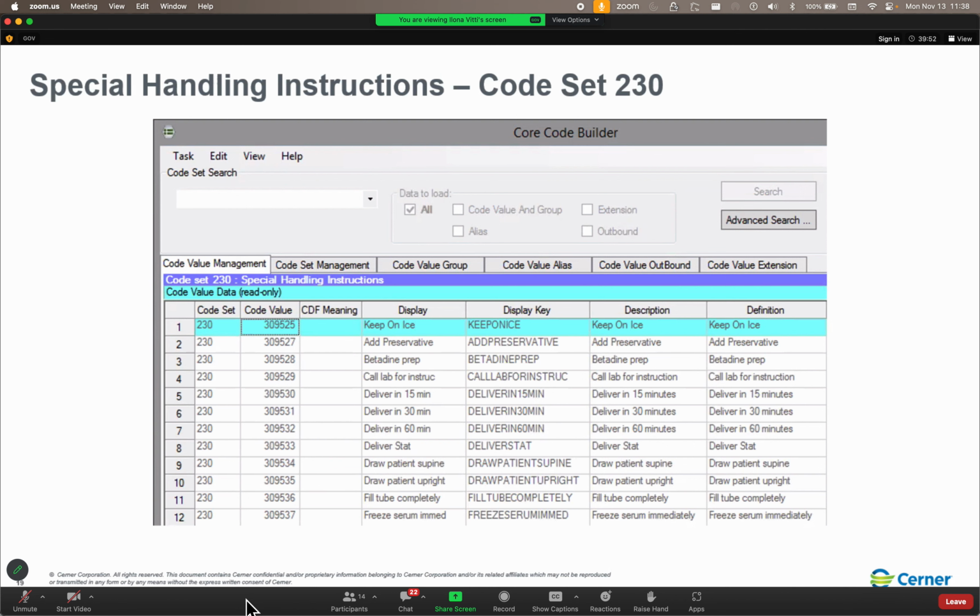So that means that when we are assigning the accession numbers with the site prefix, if model has a site prefix of 33, we could have a 33 and then 23, 1, 2, 3, 4, 5, 6, 7. And maybe we could have a 35, 23, 1, 2, 3, 4, 5, 6, 7.